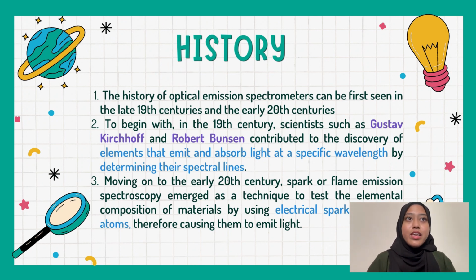To begin with, in the 19th century, scientists such as Gustav Kirchhoff and Robert Bunsen contributed to the discovery of elements that emit and absorb light at a specific wavelength. And in the early 20th century, spark or flame emission spectroscopy was used as a technique to test the elemental composition of materials by using electrical sparks to excite atoms.